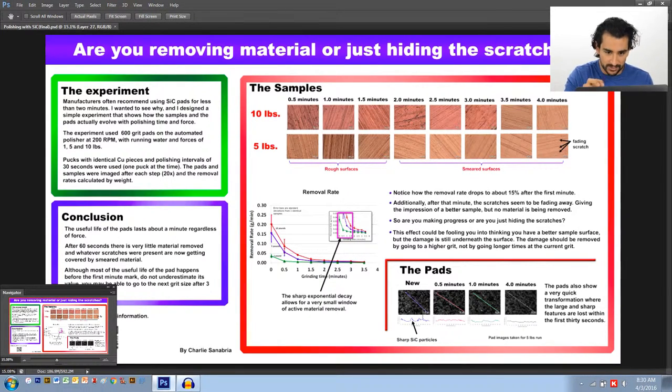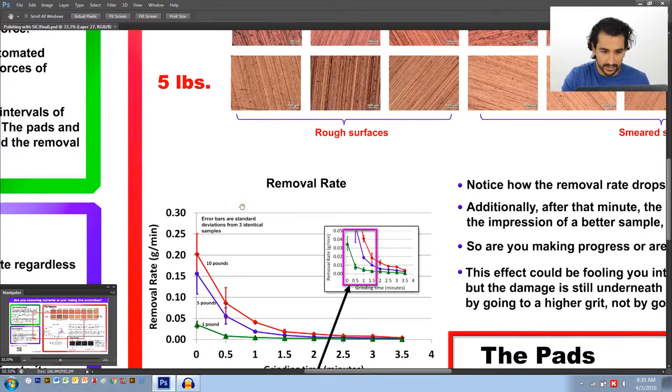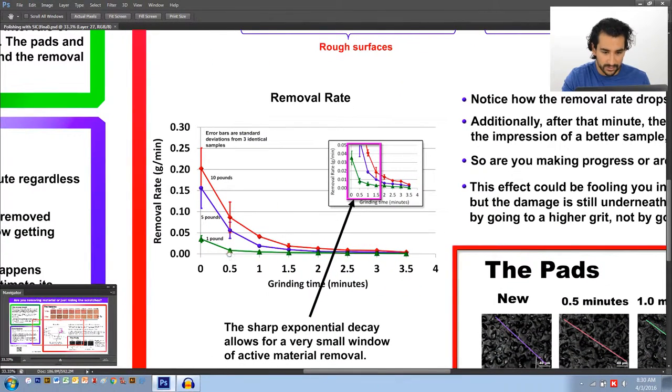But what I found out, at least with this grit size, is that the material rate plummets very quickly. Within the first minute or so, you're down to about 15% of your material rate removal. And you may say, well, if I use a low force, maybe they last longer, right? But that's not the case. Look at the one pound trays, this green one. 30 seconds after you've started, you're down to 30% of your material rate effectiveness. So keep that in mind when you use these pads.